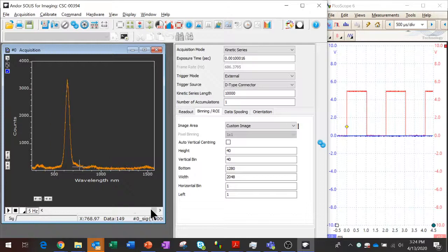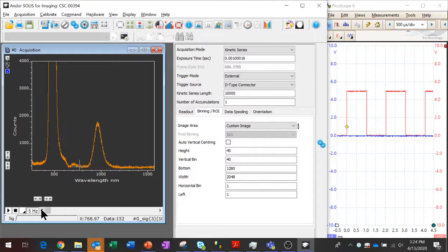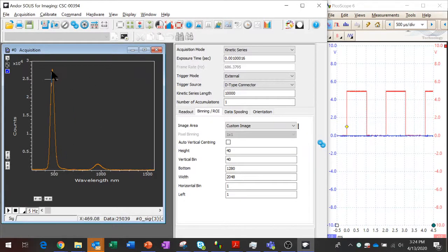And you can see that I'm able to discern individual channels in the light source turning on and off with time. So I'm going to change the auto scale here on the data, rescale it to the brightest channel. This is my blue channel right here, which is the brightest on the LED source. Then skip ahead to the next exposure. So I have blue, red, green, blue, red, green, over and over again. So I'm able to demix the temporally mixed up spectrum that I had in the first one by doing high-speed spectroscopy using this camera.